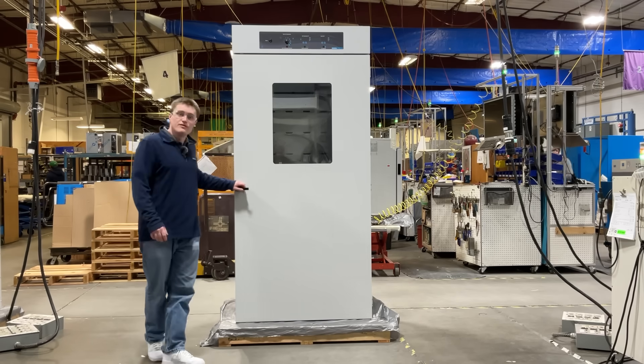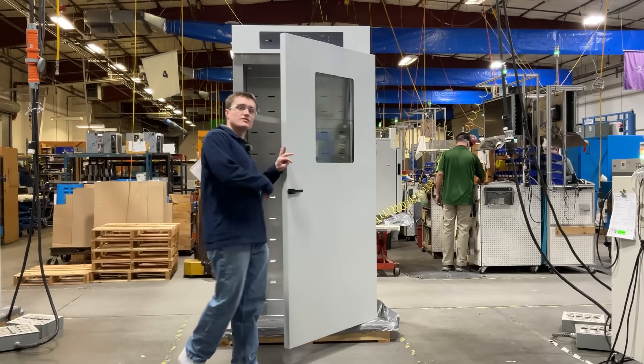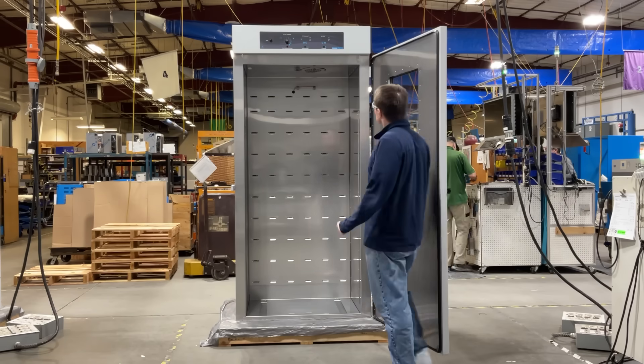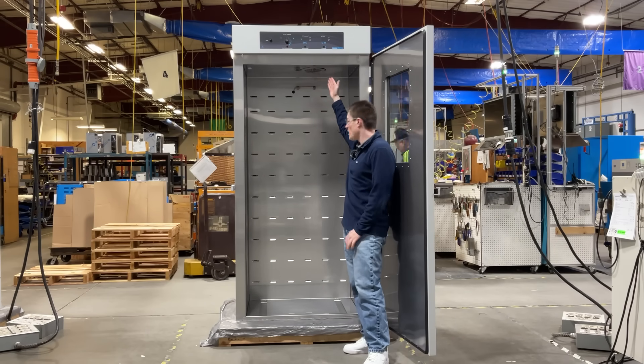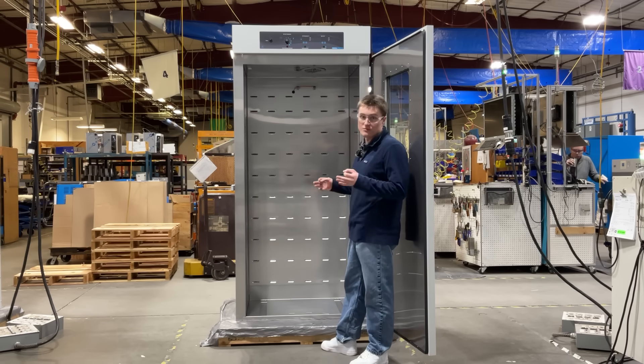Take a look inside the unit. The first thing you will see is the glass viewing window. This allows you to take a look inside the chamber without actually opening it. Next, you will see the circulation fan. This, coupled with the louvered back panel, provide incredibly stable and uniform temperature control.